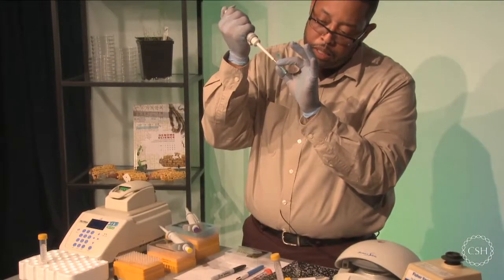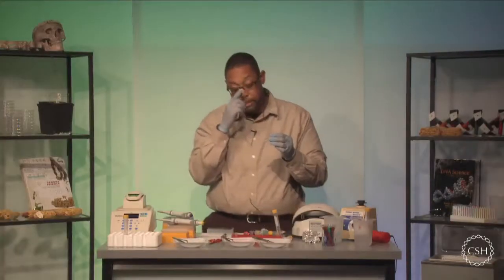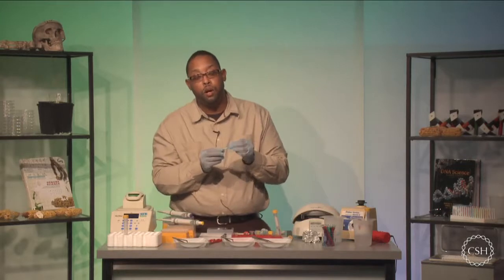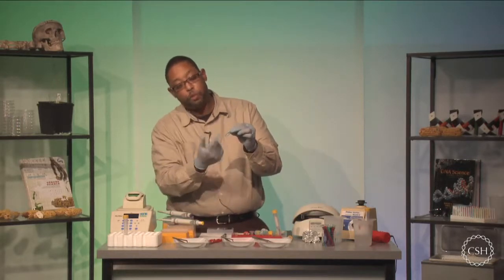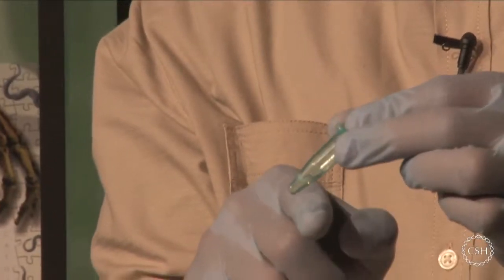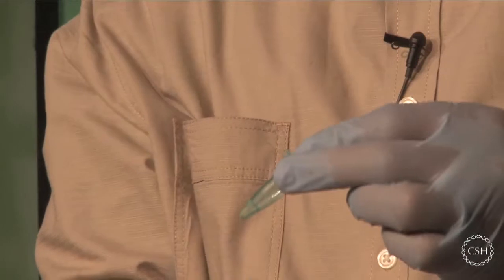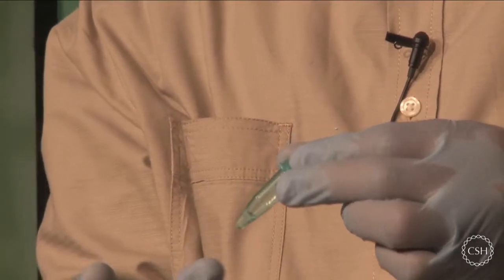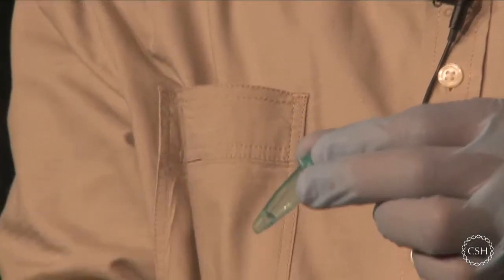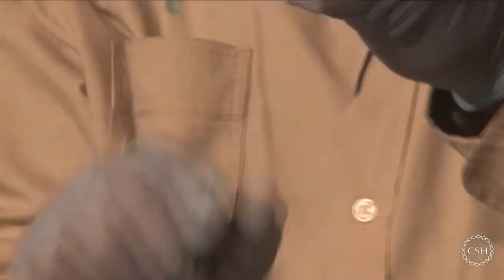All right, so that's the last test tube. And what I want to make sure is that the silica resin actually gets mixed rather well with the supernatant, not the tissue. The idea is that the silica resin is just going to float around in there, but I want to make sure it evenly distributes across the sample set, because there's a lot of resin inside of here. So what I want the sample to do is to turn from this clear lysate to a cloudy solution. So I'm just going to finger vortex here.